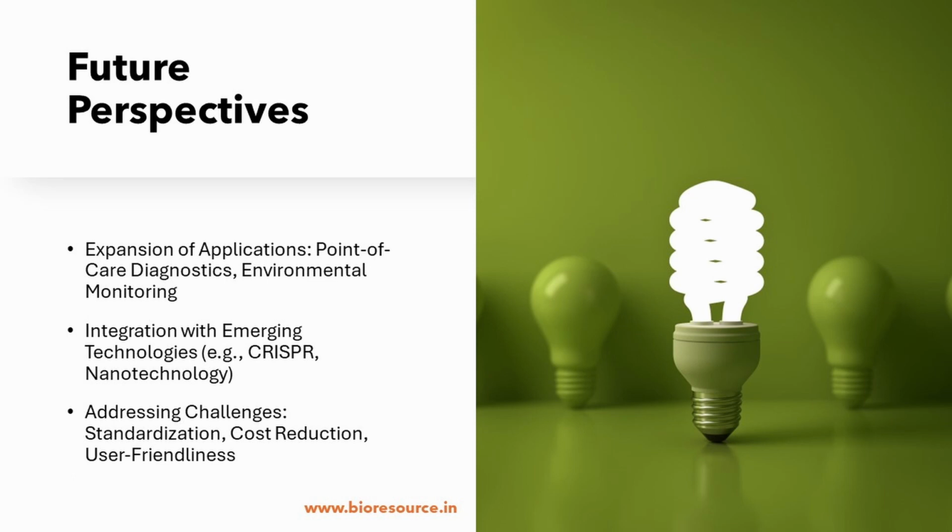So one of the areas everybody is keen on is point of care diagnostics, because MNP isolation's rapid, efficient nature makes it suitable for developing point of care diagnostic tests, and which is even adaptable for the microfluidic based approach. So miniaturized and portable devices utilizing magnetic nanoparticles could enable rapid detection of infectious diseases, genetic mutation, and other toxin detection at the point of care, which can improve the early diagnosis and the treatment interventions.